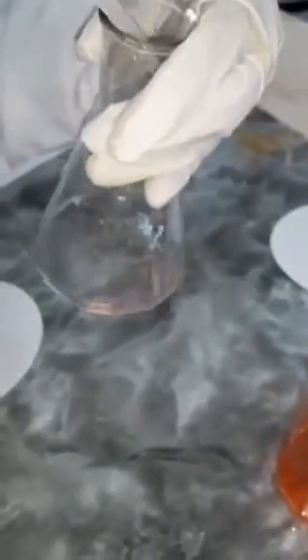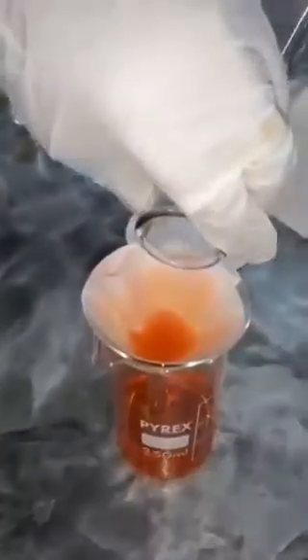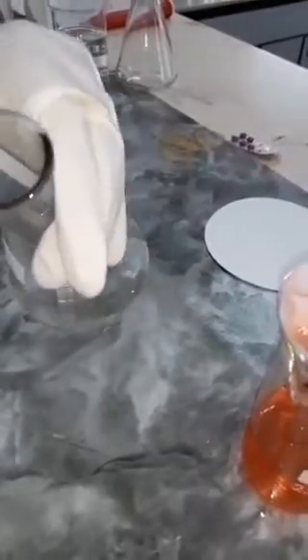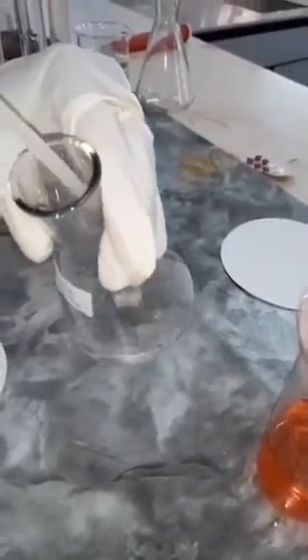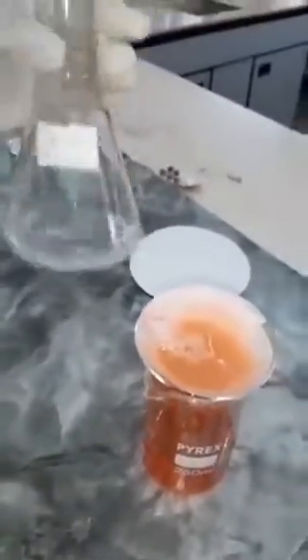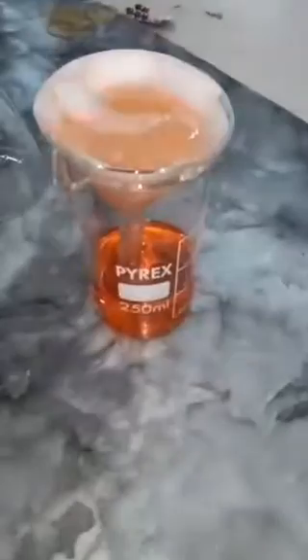And now I'm going to wash out the few remaining solution from the conical flask and add it to the filter paper. So I'm adding distilled water. I'm just washing down everything and adding it to the filter paper. We're also going to filter it and add it to the solution. So there's still some bits of the solution that's remaining. So we'll continue washing. So now we'll wait for everything to filter.